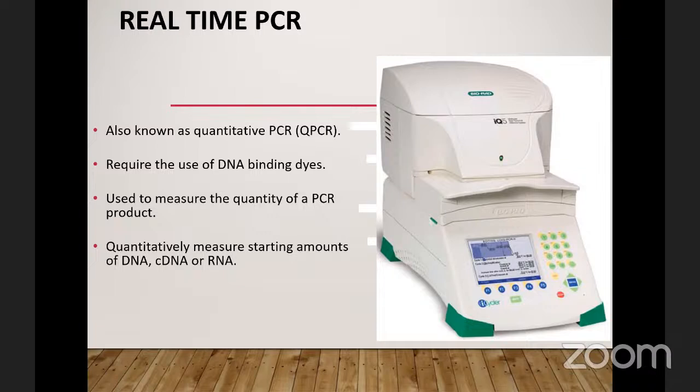You are seeing the reaction happening, both the temperature profile changes, whatever is happening, you are able to view it in real time. It's different from conventional PCR, which is endpoint based, in the sense that, oh, I'm going to set up something in the cycler. After setting up, I'll bring it out. I'll set up gel electrophoresis. I'll allow the gel to run. Then I'll do size-based discrimination. I'll then start interpreting the result based on the size of the separation of bands that I've seen.